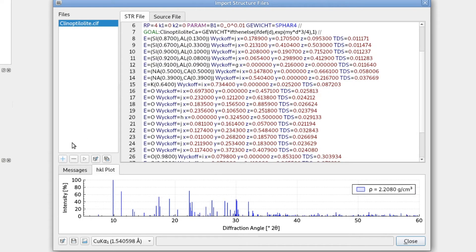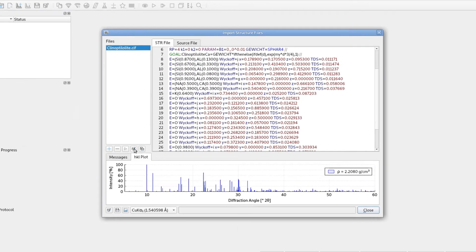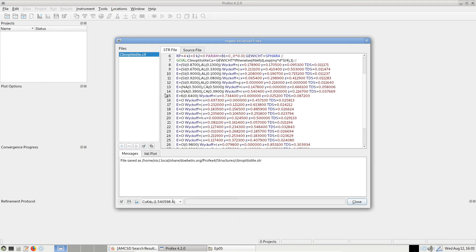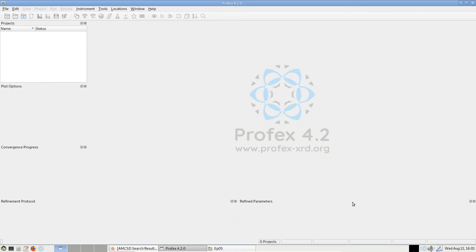And we can just save it as we did before. And this time I will give it a name. And if we close, it should be indexing this file. And that's all we have to do.